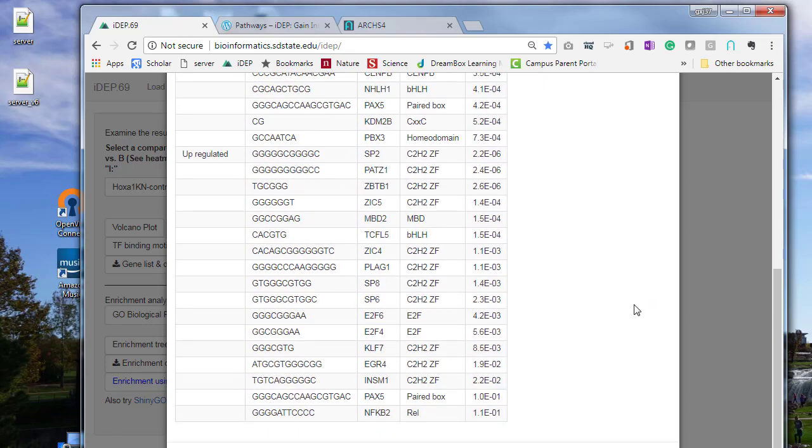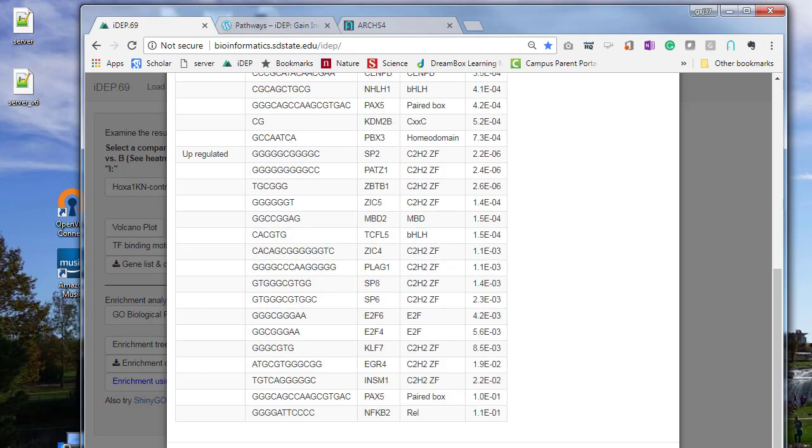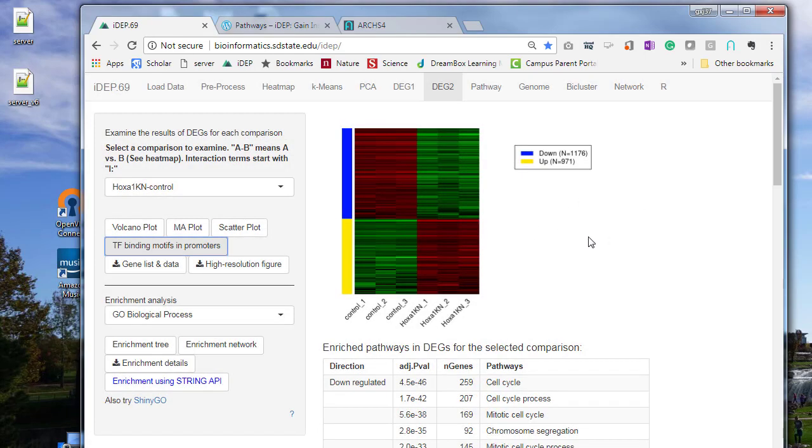As you could see over and over again in this application, you got a lot of results, but don't get too excited by each one of those. Try different methods, try different combinations to see what is a really robust result.